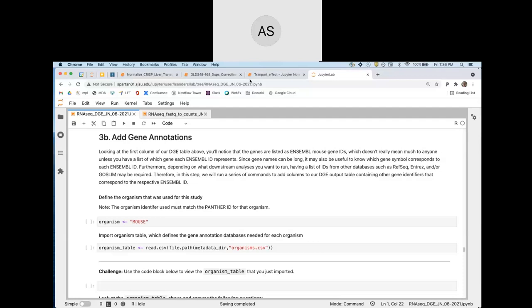And also, because they're only looking at the first 50 base pairs of a read, you could have reads that are identical in the first 50 base pairs and then different in the next 100 base pairs, right? So we have 150 base pair reads. And so using FastQC's algorithm, you could also be throwing away reads that are indeed unique.